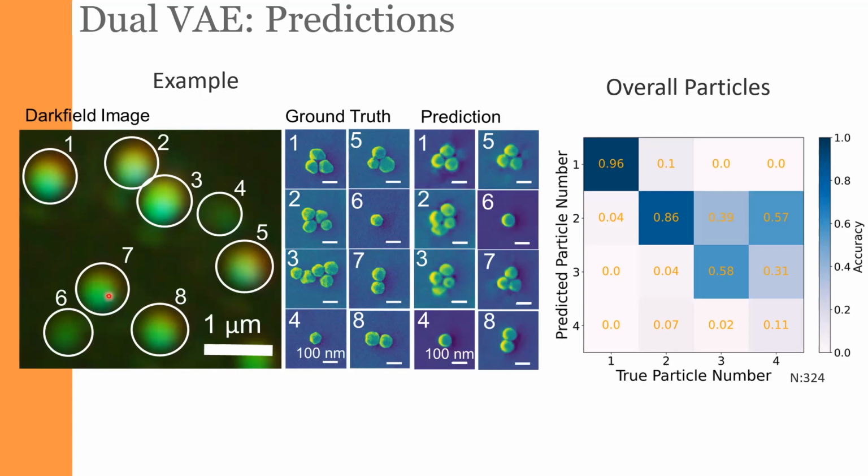So the shape of the blob is Gaussian because the size of the object is very, very small. So this is just the optical resolution. And each blob contains a spectrum, so we can average over the blob and have the full spectrum.